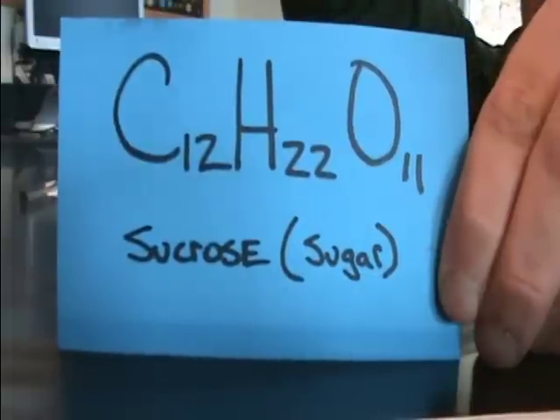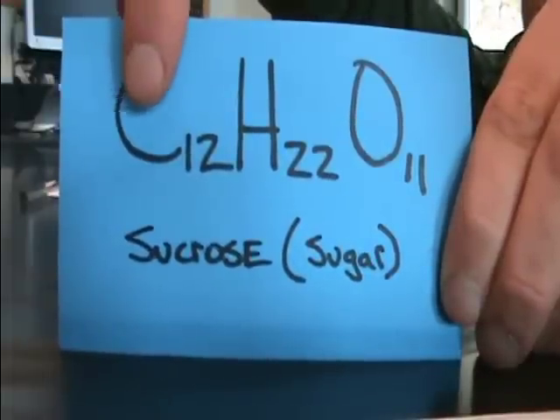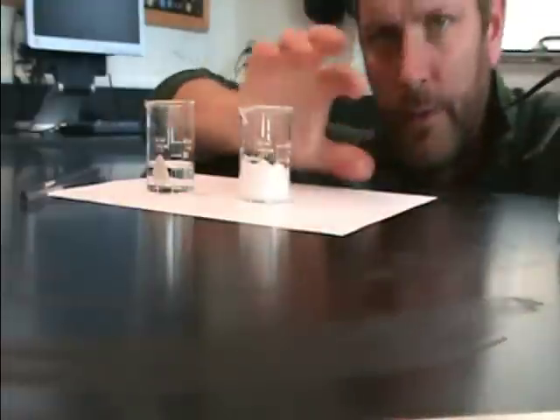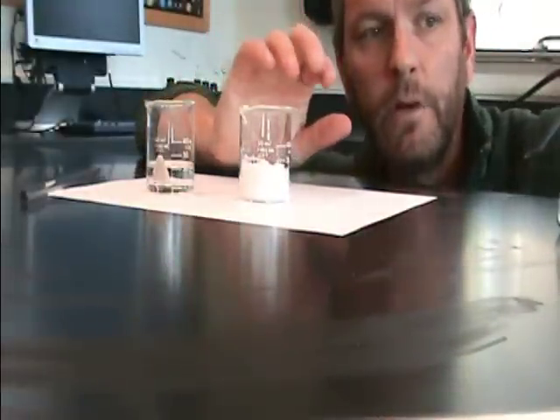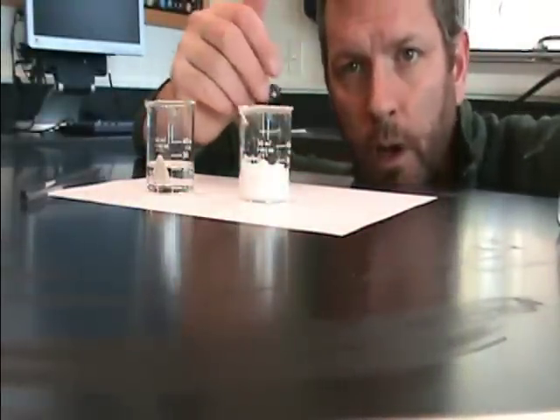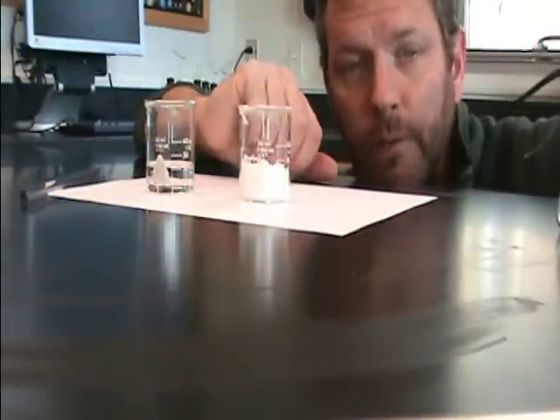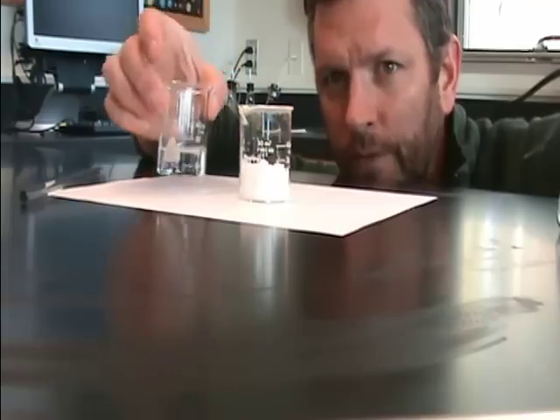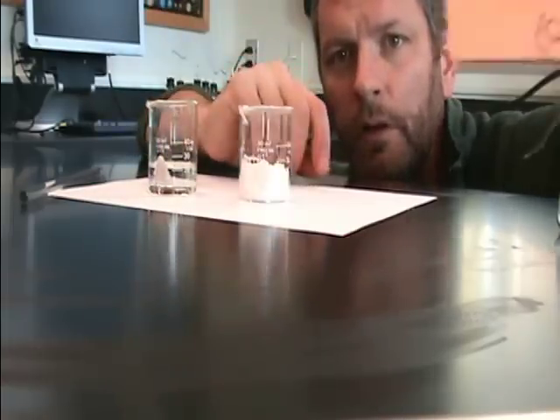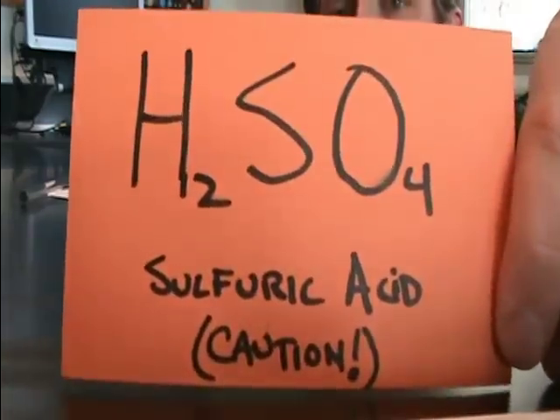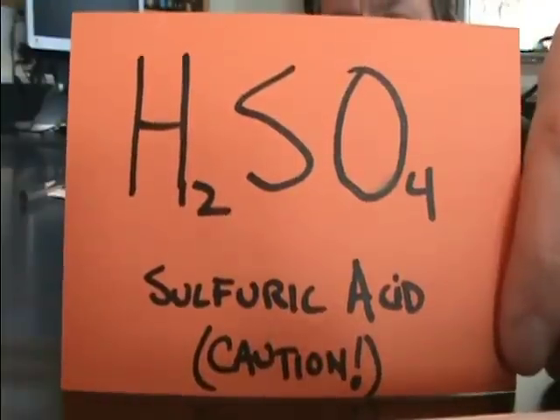Notice the components that you have: carbon, hydrogen, and oxygen. These are bonded together in a certain way to form what we know as table sugar. The other substance right here, this liquid, is a fairly dangerous substance called sulfuric acid.